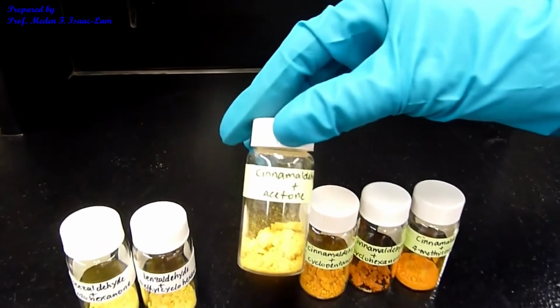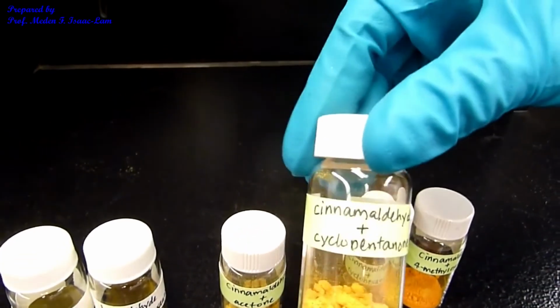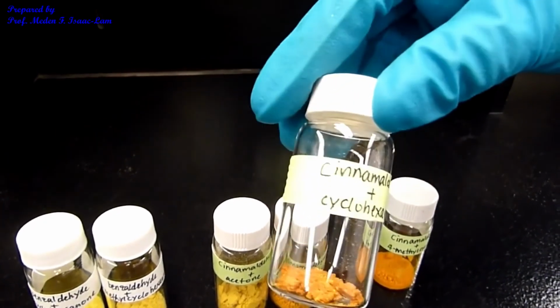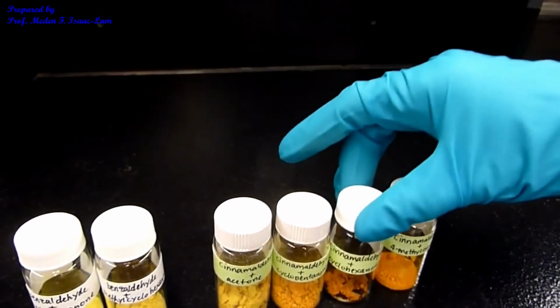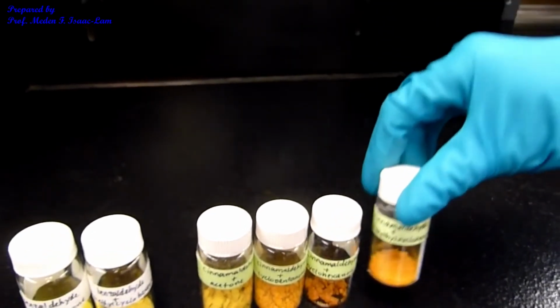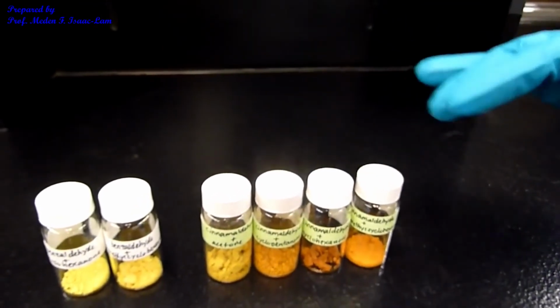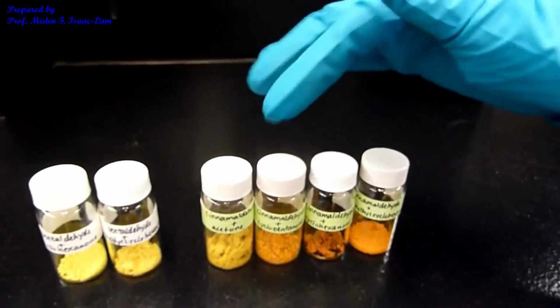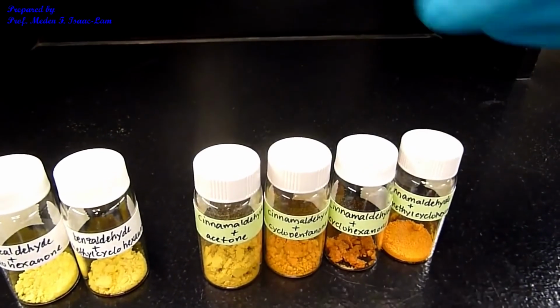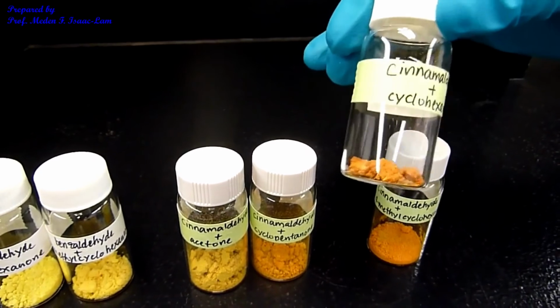So cinnamaldehyde plus acetone, and then cinnamaldehyde plus cyclopentanone, cinnamaldehyde plus cyclohexanone, and then cinnamaldehyde plus 4-methyl cyclohexanone. So depending on the ketone that you're adding to cinnamaldehyde, you will have a different range of color. So it's ranging from deep yellow to about orange or rust-colored sample for this example in here.